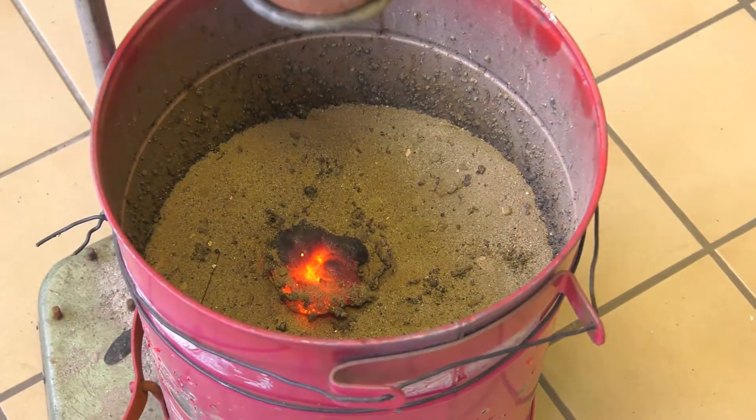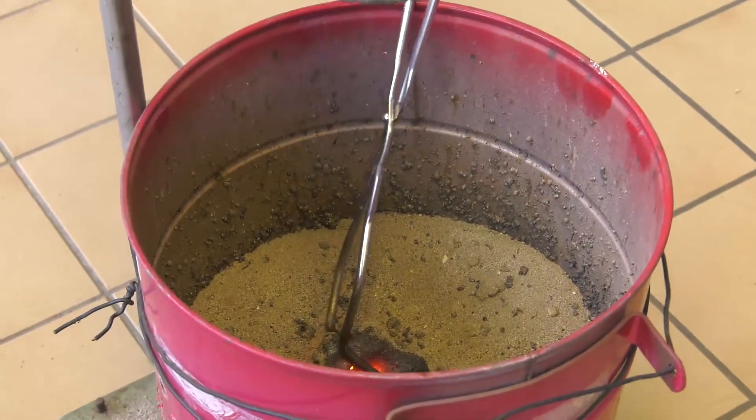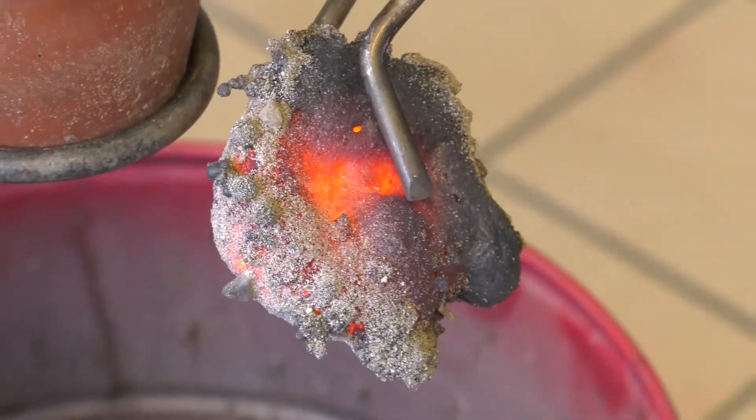The burning thermite shouldn't be extinguished with water — it would evaporate immediately and an explosion may take place. If you really have to extinguish it, you have to use sand instead of water.